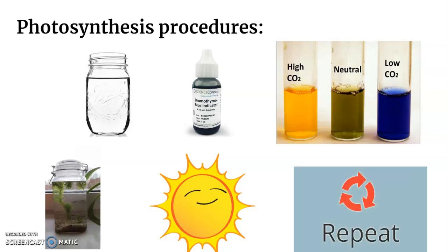Jar number 2 should not be exposed to sunlight or any form of light. Jar number 3 should be unsealed. Jar number 4 should have 2 times the amount of Elodea. And jar number 5 should have 2 times the amount of carbon dioxide in the water. Observe these jars for 3 days.